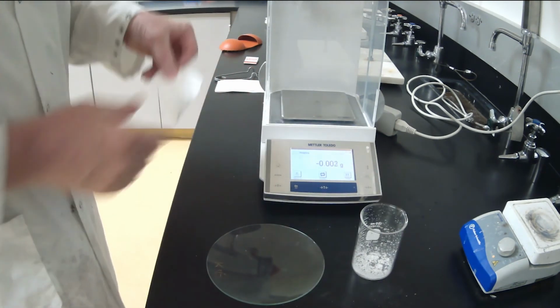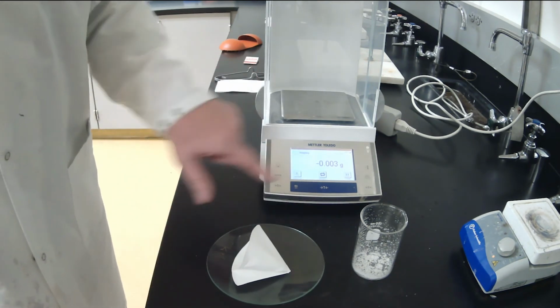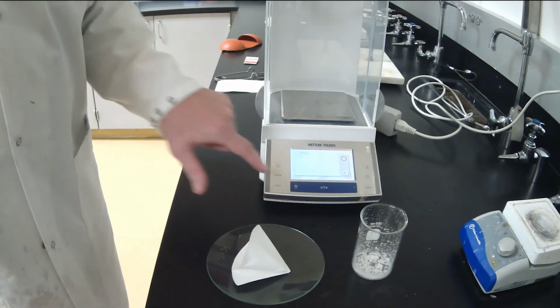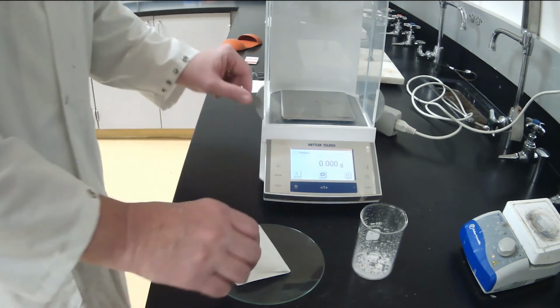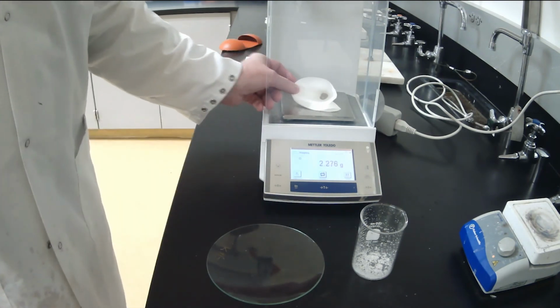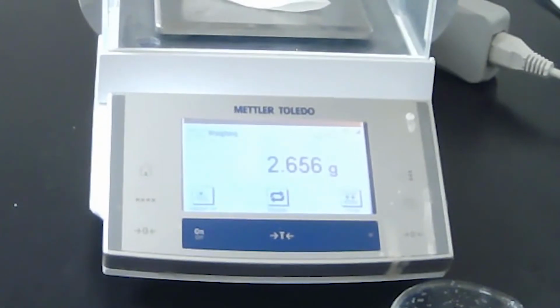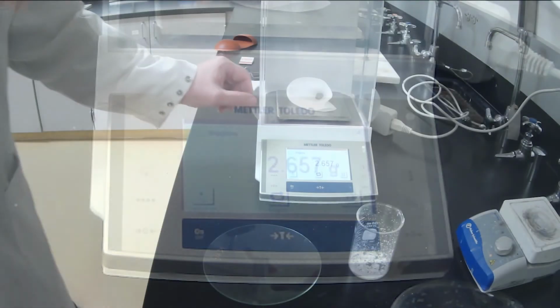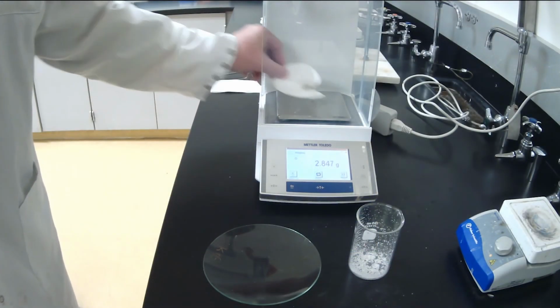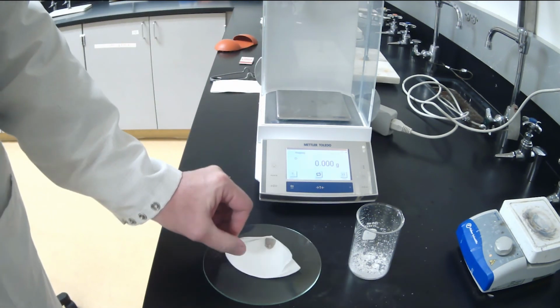So let's do the filter paper first. Not very hot. Okay, so this is our sand plus filter paper. Check the number. All right, record that in your notebook. And you can see the sand is still in the bottom of our filter paper.